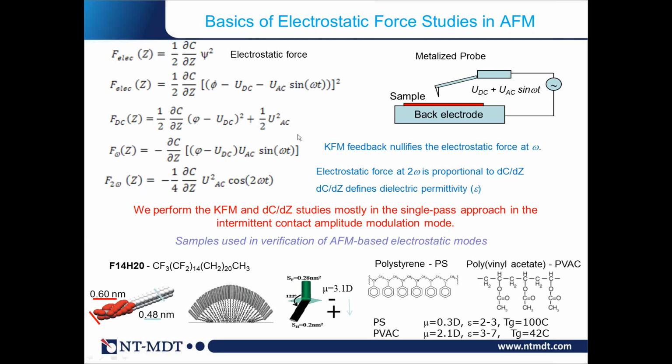Typically, the situation in measuring electric response of the surface is described by models where people consider capacitance-like settings, where the electrostatic force interacts between the tip, usually a conductive probe, and the sample put on the back electrode. The sample can be conductive by itself.